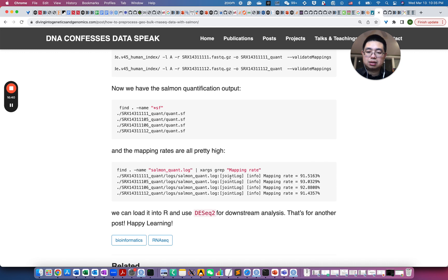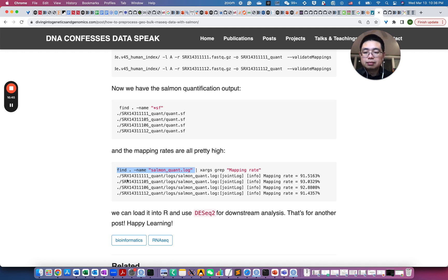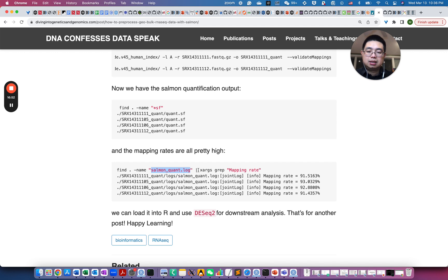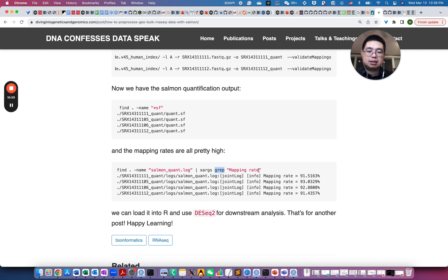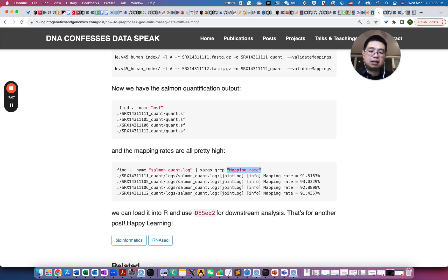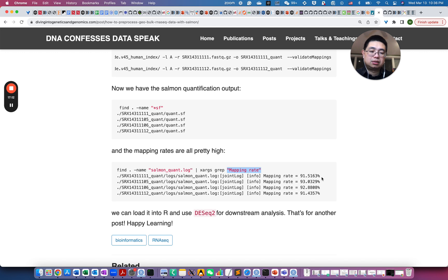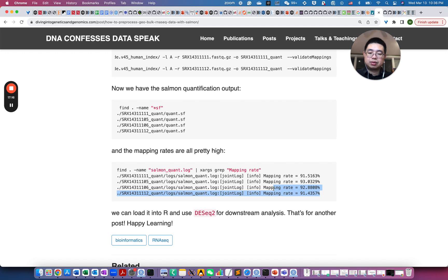And you can also look at the mapping rate for all of them by using find command. So find the current directory, and all the files that match this name, and then you use xargs to actually send it to the grep command, and then you would grep the mapping rate. So for each of those files, it will grep, so you can find this pattern in each line, and then you'll see there are actually over 90% mapping rate, which is great.